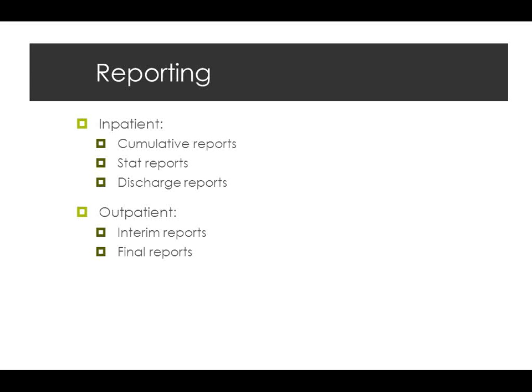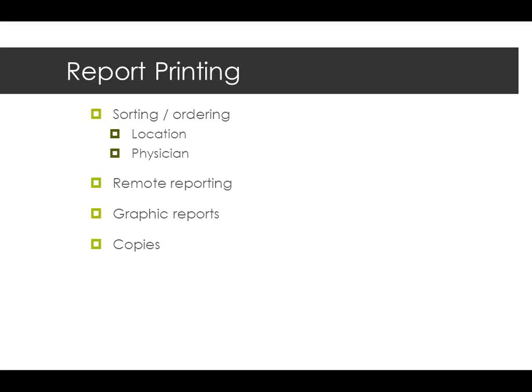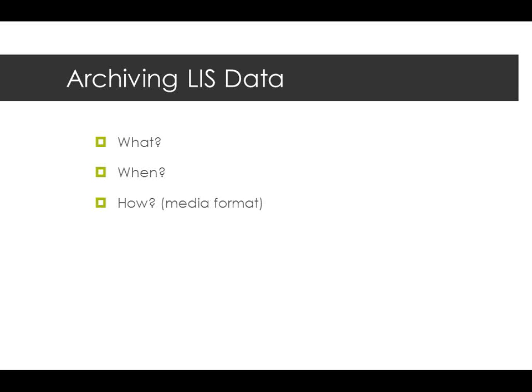Obviously, with electronic reporting, a lot of this is going away. If you print reports, then how are you going to sort them and order them by location, by physician? Do you want to do remote printing? So I'm actually printing at a clinic or printing in the emergency department to give them information quicker. Do you print graphic reports? Some clients want graphic reports rather than kind of textual reports. How many copies you're going to print, copy twos, those kind of things.